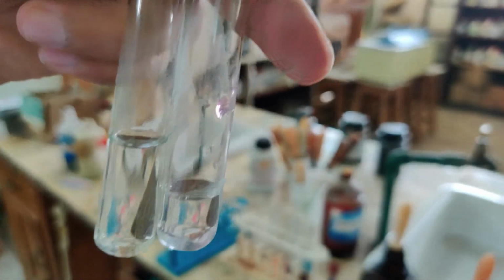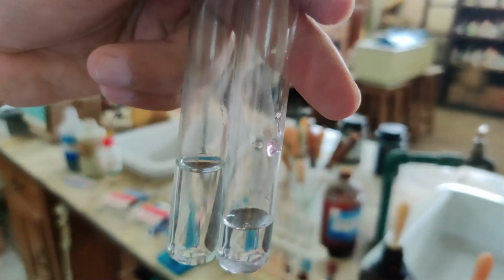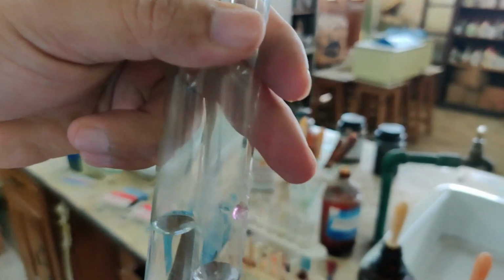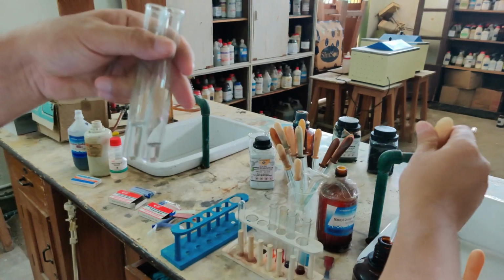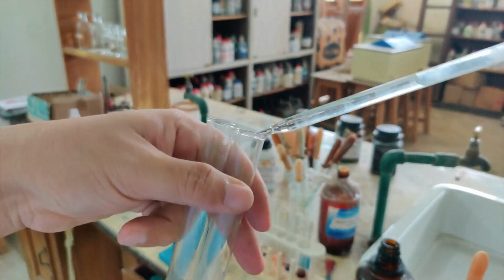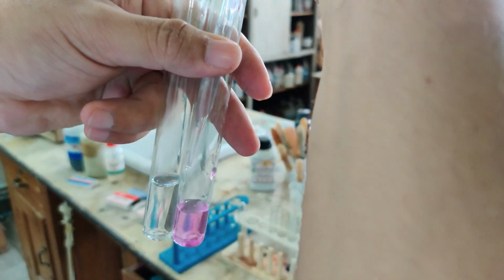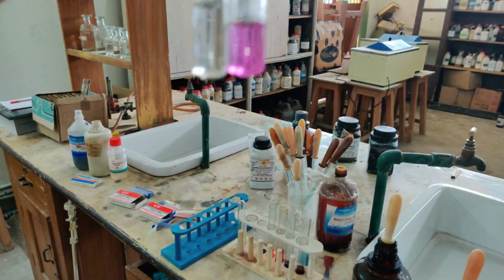Now the second test tube contains a very small amount of phenolphthalein. The first test tube has become larger in volume because I added dilute hydrochloric acid. Now in the second one, let me add ammonium hydroxide. I am going to add ammonium hydroxide in the second test tube. See the change in the color that you notice. A very nice color has come out.